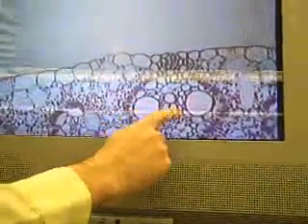Okay, good. So this is a vascular bundle on a leaf right here. You can see basically it acts like the circulatory system of the leaf. It transmits water, dissolved minerals, dissolved food, dissolved carbon dioxide, and things throughout the leaf.